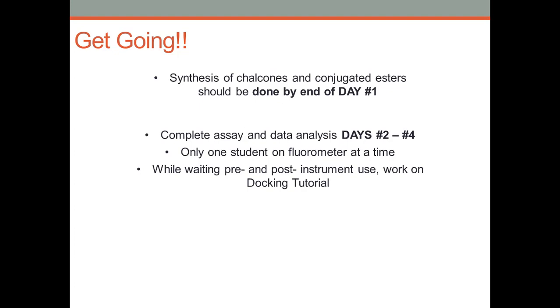This is a great activity and will allow you to visualize how your drug is binding to that target pocket, the empty active site of hemoglobin. This will definitely help with your analysis and your write-up because you'll get to make a really nice figure that will show how your drug is binding to that target pocket.